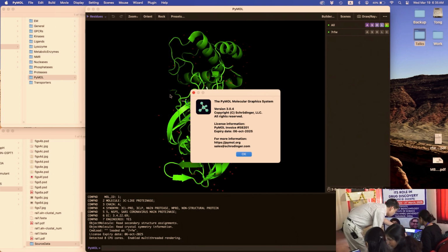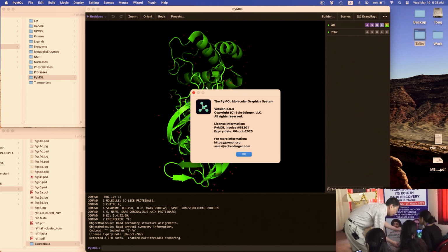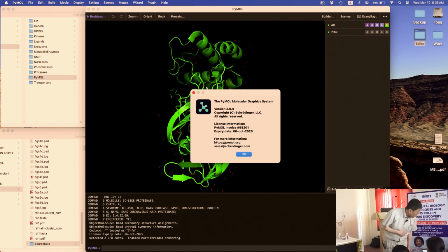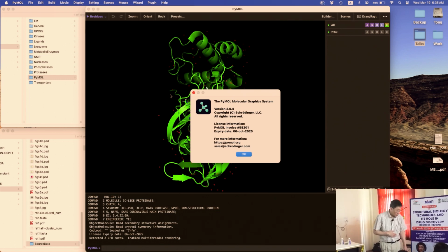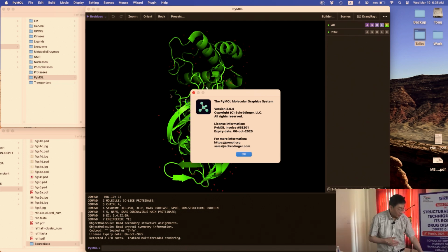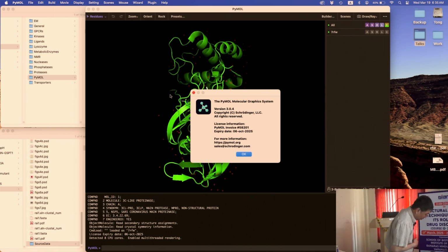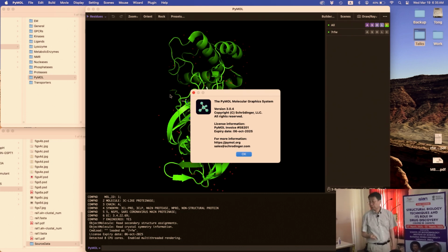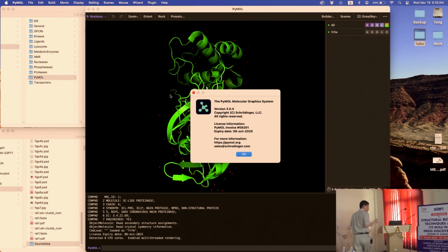You opened it 3 times, so there are 3 states already. No, sir, it is not opening even the first time. I see. Okay. I'm not sure what's going on there. So you cannot open any files, or only this file you cannot open? This file came from the PDB. It should open. Okay. Oh no.